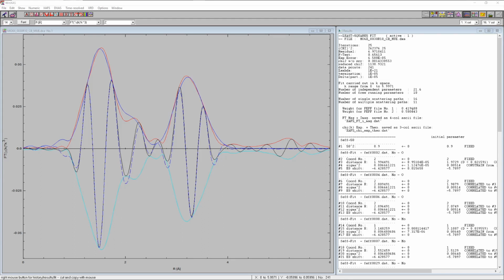So if we do not have molybdenum dioxide, for instance, which applies to the first spectrum in the series, we start with molybdenum trioxide only, so the concentration of molybdenum dioxide is 0, and the free running parameters that we have for the molybdenum dioxide phase would not at all influence or affect the amplitude of the XAFS function, and this would not result in any meaningful result of the refinement. To avoid this, the program actually fixes for those cases the parameters of those phases and removes them from the refinement.